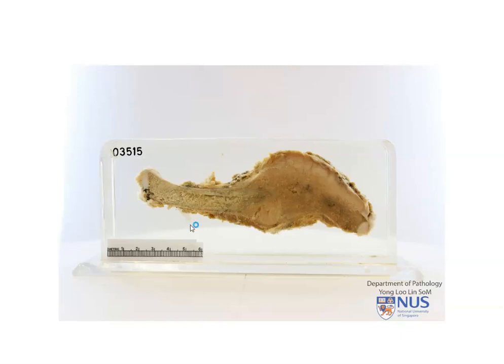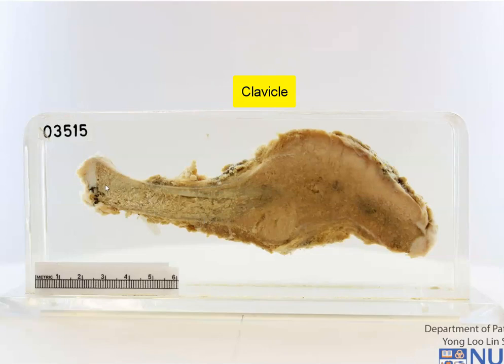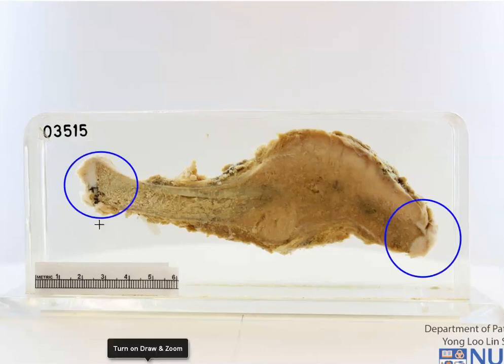Hello, this is the pathology specimen of a clavicle. We can see that at both ends there is a whitish area, and these areas represent the epiphysis, where this is the epiphyseal growth plate.